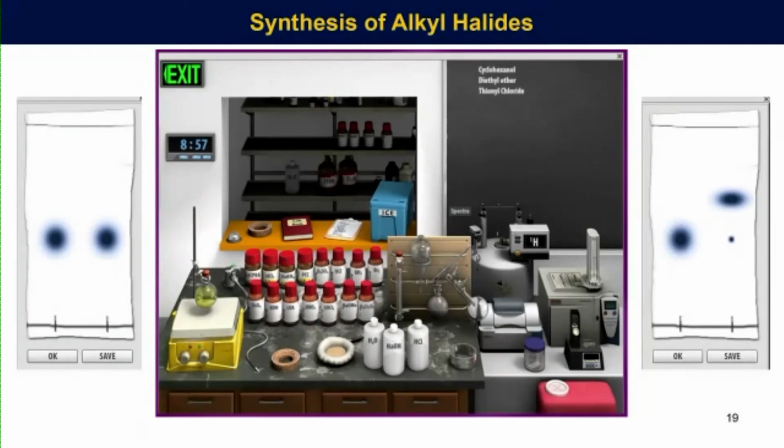And you can see on the right-hand side, the TLC again shows the relative polarities of these things in a very nice way, which students start to appreciate.